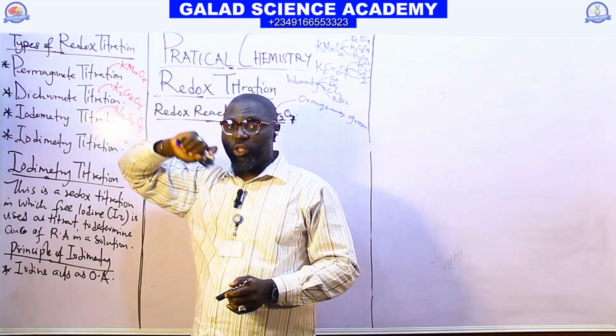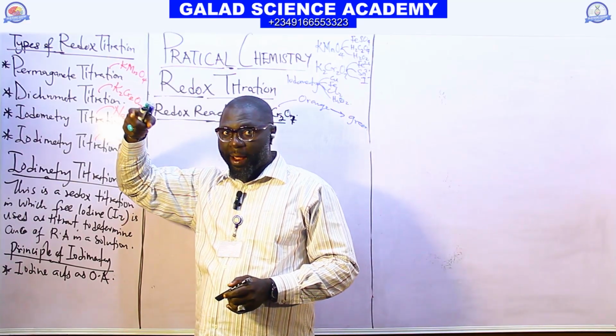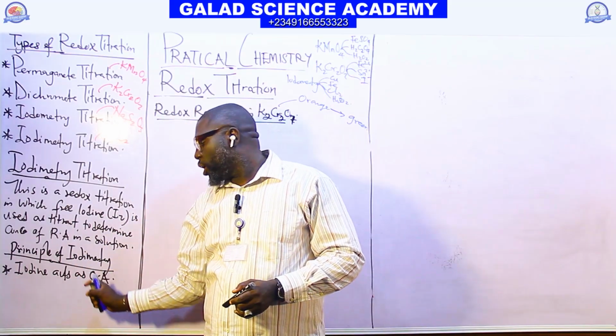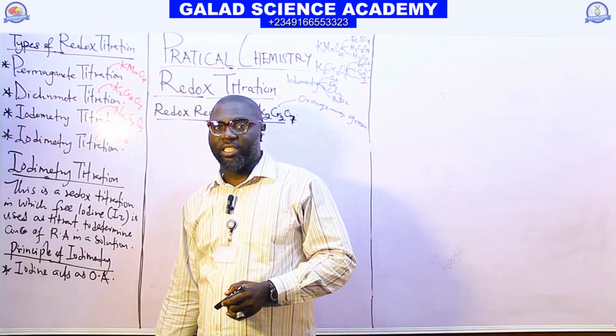But in iodometry, copper ions act as oxidizing agent.